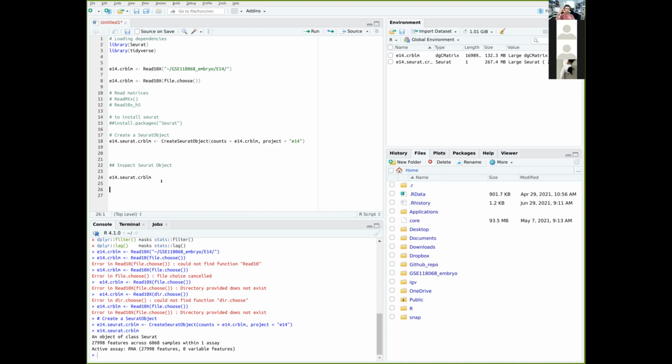Before that, maybe I should give you a mental overview of this Seurat object before we move on. It's not complex. This object is not complex. It's very simple, just that it follows this rule of object-oriented programming, whereby instead of beginning with a function or a process, you begin with an object. So if you think about it as a crate, as a box, you are presented with a box which has small holes in there for you to put in all your information, and these holes are already pre-created for you.